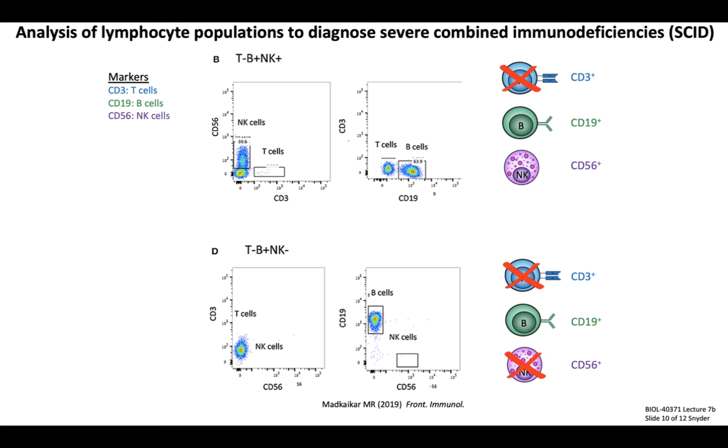This initial diagnosis of the major lymphocyte population deficiencies observed in a patient is a very important first step in confirming that the patient has some form of SCID that's defined by some combination of missing lymphocytes. In either of these cases depicted above, a clinician might next order additional genetic testing to try and determine the underlying mutation of each type of SCID, or they might also run flow on additional surface phenotyping markers or intracellular signaling proteins. Determining the likely genetic defect that is responsible for driving a patient's SCID pathology is an important next step before deciding which types of treatments are both available as well as which ones are worth pursuing.